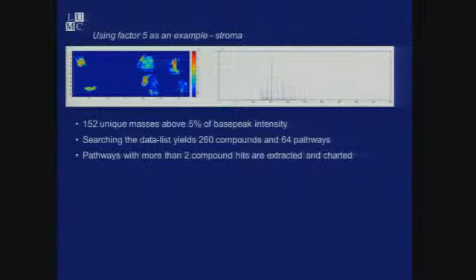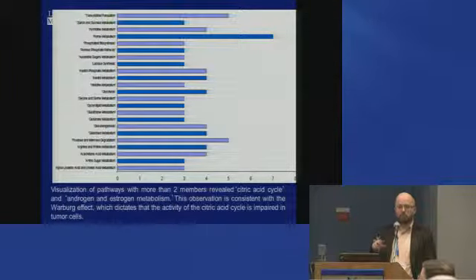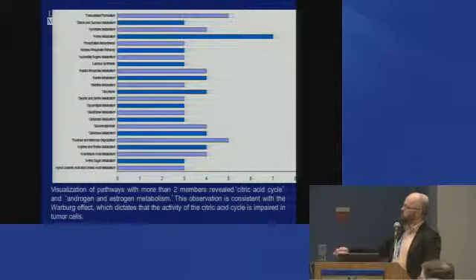And so if we actually had a database of real metabolites that have been detected in these tissues, we'd be able to improve this a lot further. So if we look at these pathways and plot some of these, say, pathways in which more than 2 metabolites were actually detected, what we do is plot the pathways, and this is the number of metabolites that were detected.